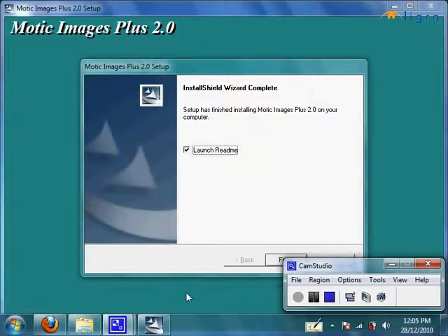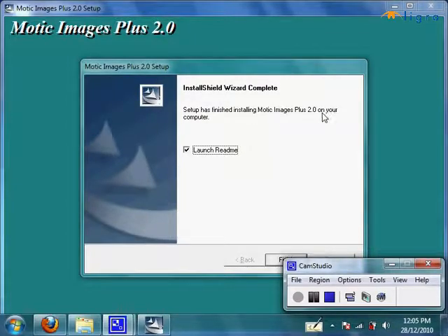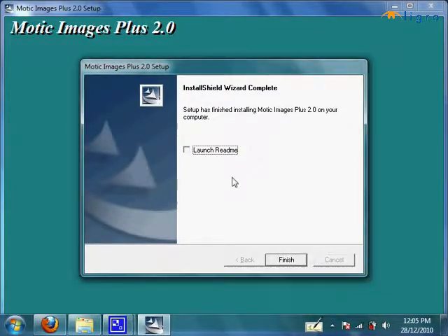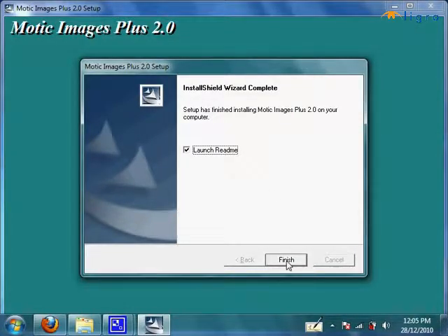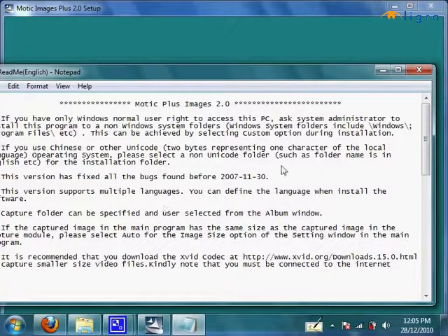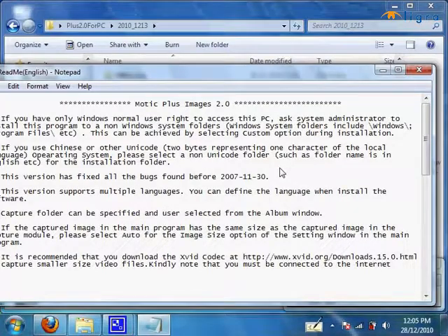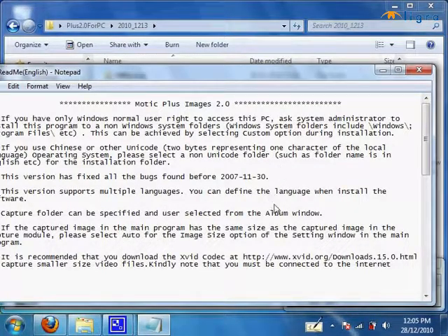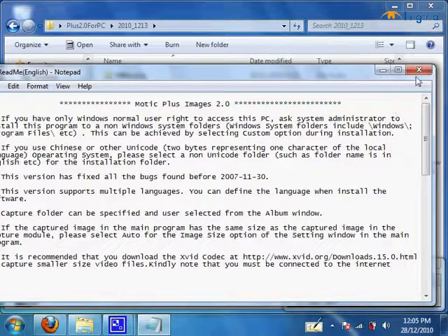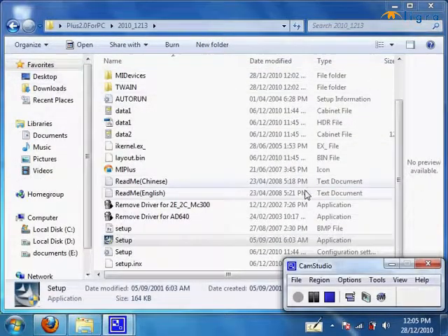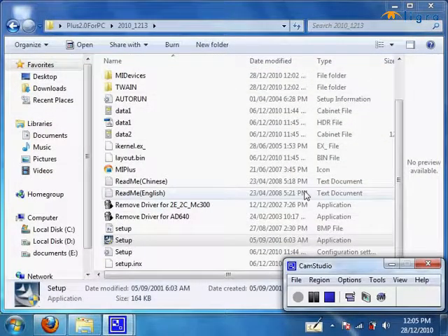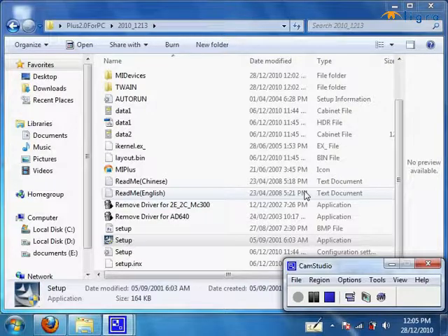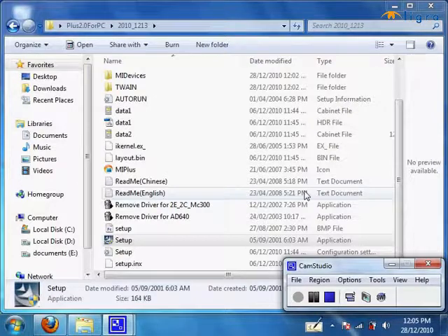Once it's done installing, it will pop up this window saying setup has finished installing Motic Images Plus 2.0 on your computer. What you can do is click on finish. It will launch this readme window which you can read over, but since it has nothing important to say, we'll skip over it. Now all I need you to do is plug in your Moticam or microscope USB cable to your computer and power up the microscope. That's what I'm going to do now.